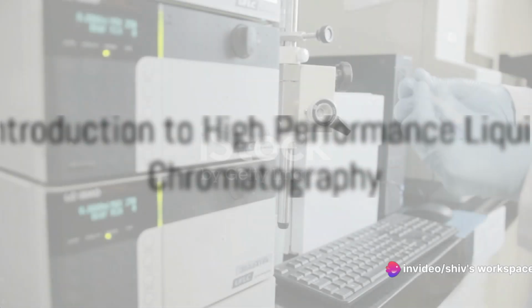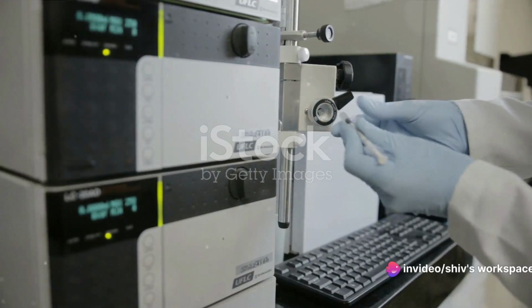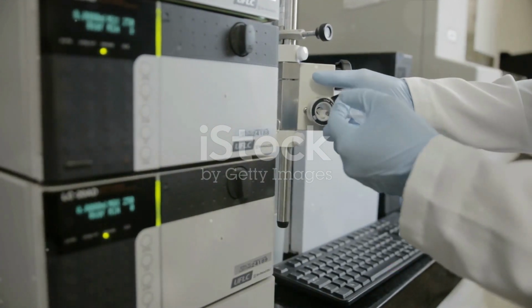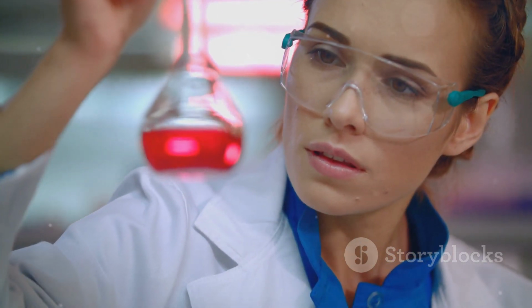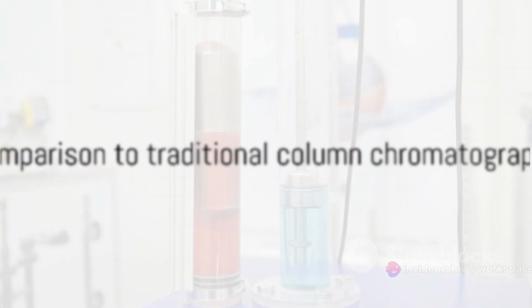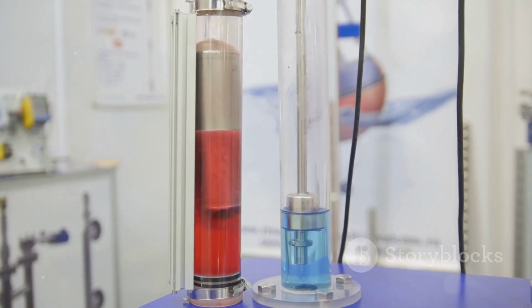Have you ever wondered how scientists separate mixtures of compounds to understand their properties? Well, one answer lies in a technique known as high-performance liquid chromatography, or HPLC for short. This technique is a cornerstone in the world of analytical chemistry, and today we're going to dive into its construction and uses. At its core, high-performance liquid chromatography is an advanced form of column chromatography.